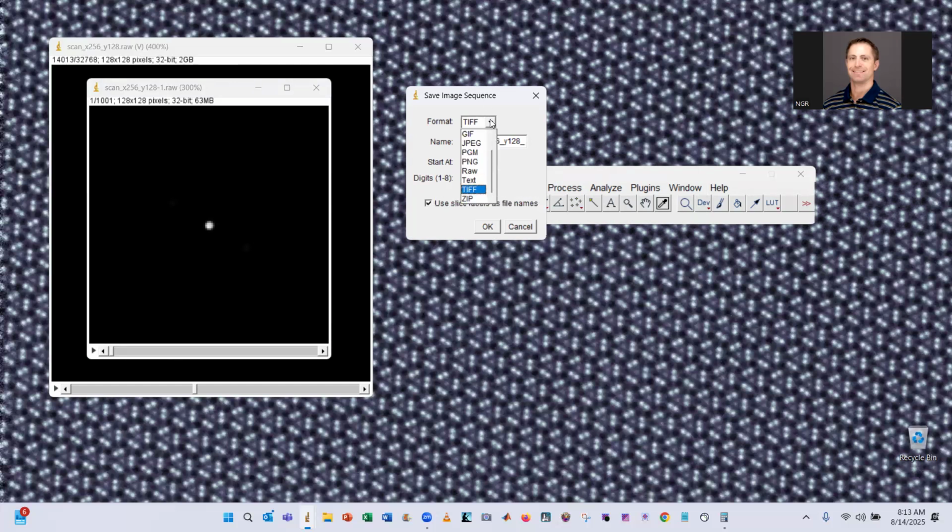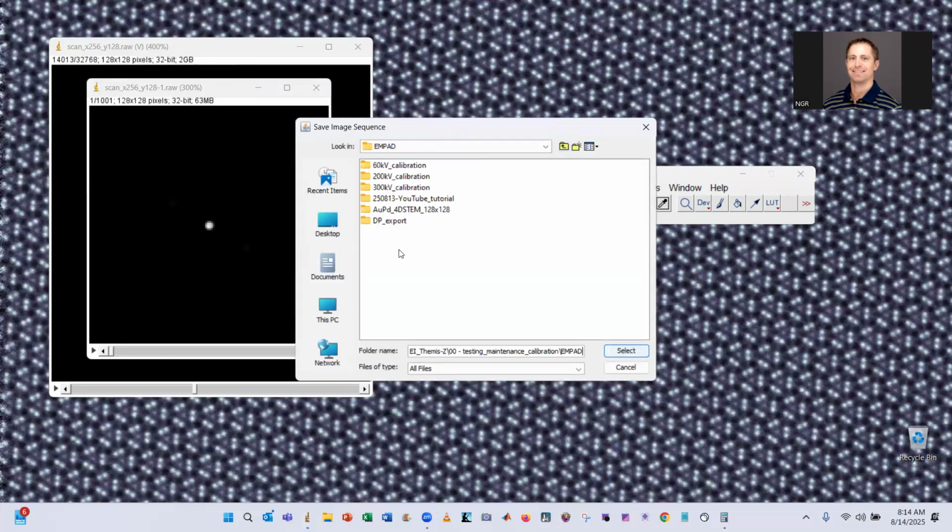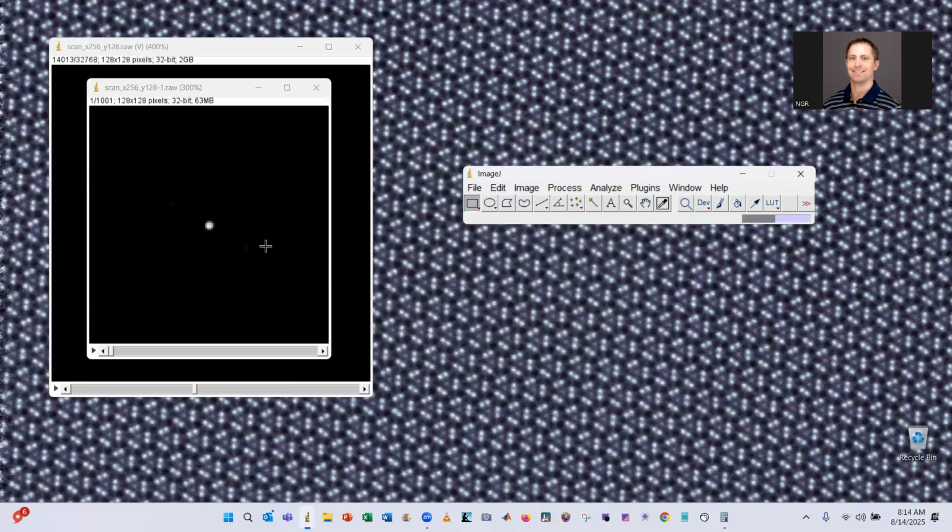Again, you have options here for the file format. Again, TIFF is going to be probably your highest quality, I believe. Click OK. And then we need to find a home for these. I already had a folder for this that I have stuff in, so let me create another one, new folder, DP export, and then click select. So you can see we can do this from a virtual stack, okay? And that's what you probably need to do if you had the full 17 gigabyte data set.